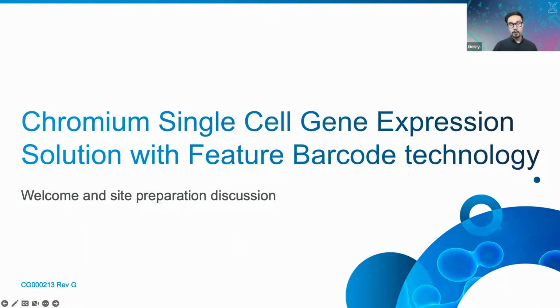So kind of a high level overview of the workflow, the things that you need, and general considerations about sample prep, about the Chromium single cell gene expression solution. This is going to be mainly focused on the 3' gene expression technology. I will discuss a little bit about the feature barcode technology, but of course there are many 10X assays. So if you are interested in any of the other ones, please let us know. But today we'll just be focusing on the simple 3' gene expression one.